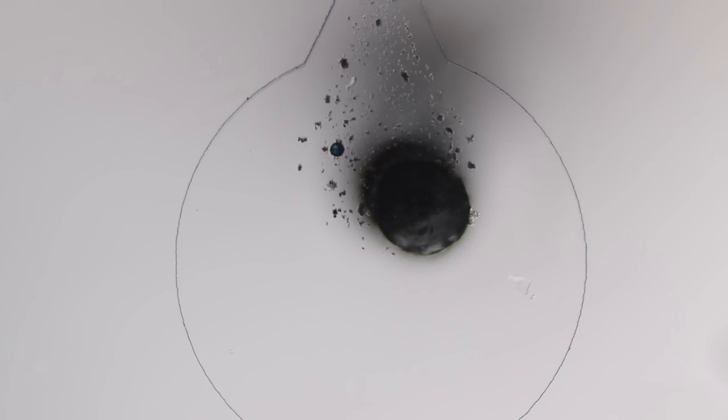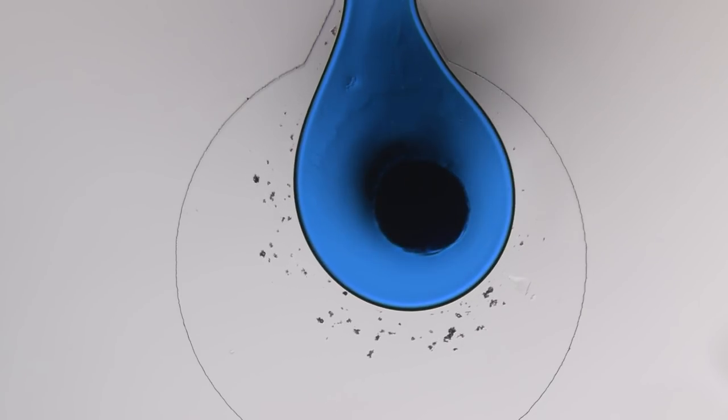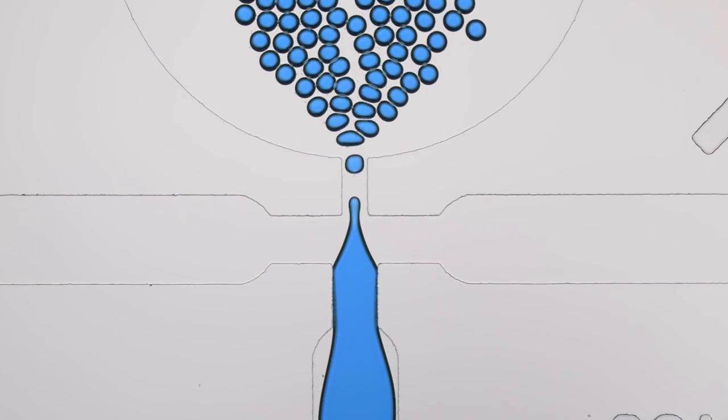This is where the tubing connects with the channel. The water should be arriving any moment now. And there it is. We just need to get back to the area where it meets the oil. And we have our droplets.